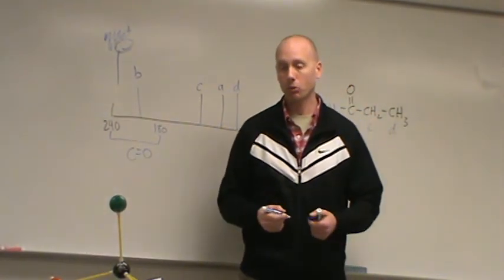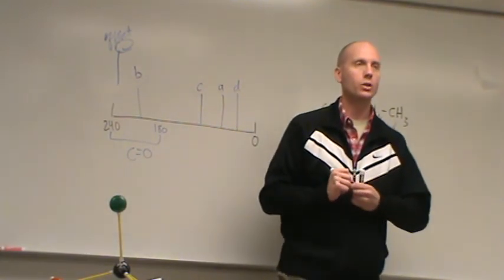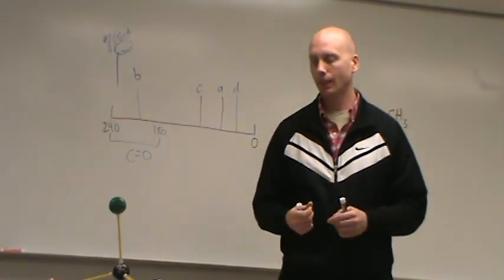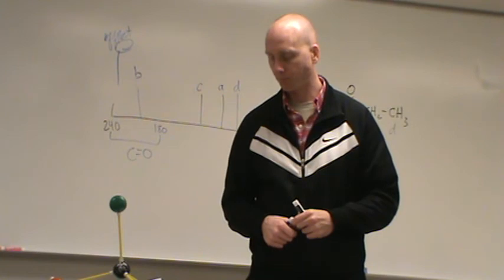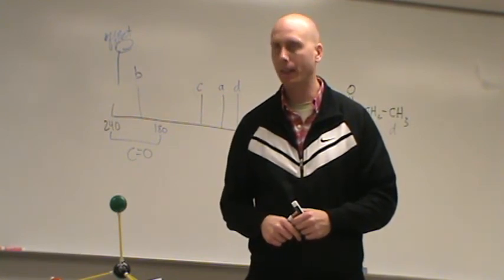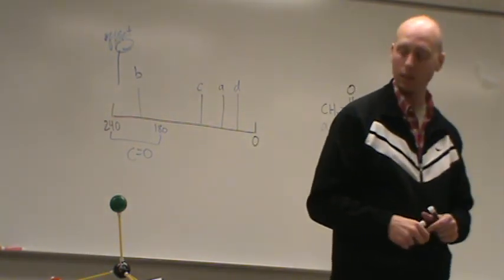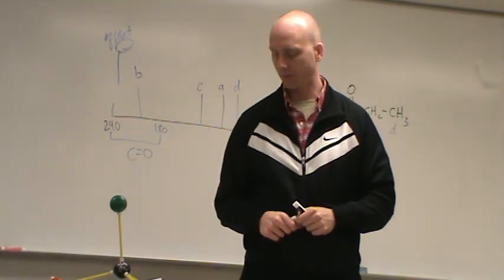So here it gave you exactly where it's showing 207, okay? So that's an offset peak, and they're just trying to help you because they chopped the thing off at 200, okay? Notice too, you still see a TMS peak. Remember TMS had 4 CH3s, so you're seeing the carbon of those CH3s, okay?